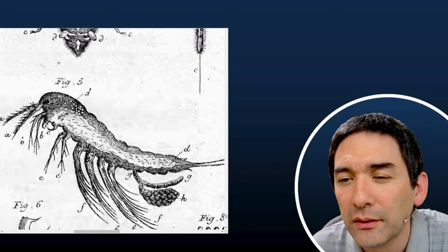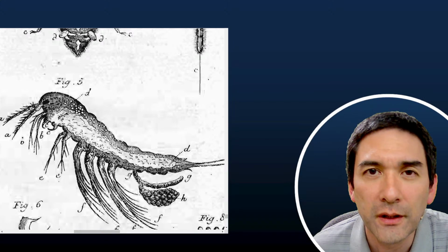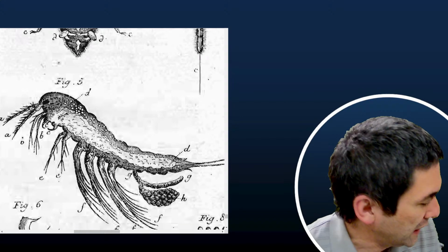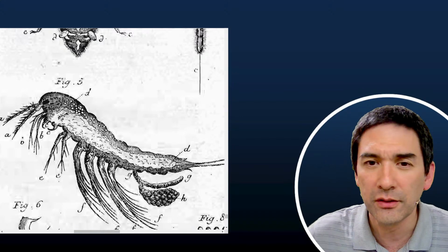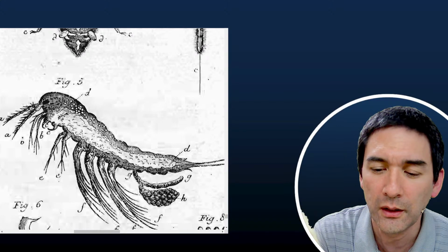Okay. So again, a couple of comments here. How do you clean the cover slips? I have tried several makes and they all appear very dirty. If the cover glasses are dirty, then what I do is, where is it? Yeah, here it is. This is a microfiber cloth for cleaning glasses. So this kind of works well.